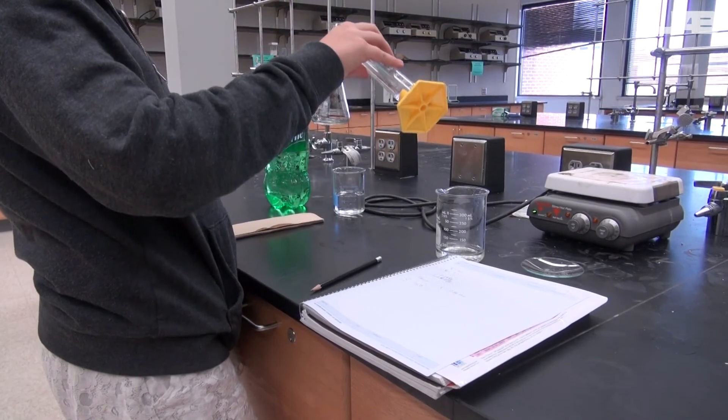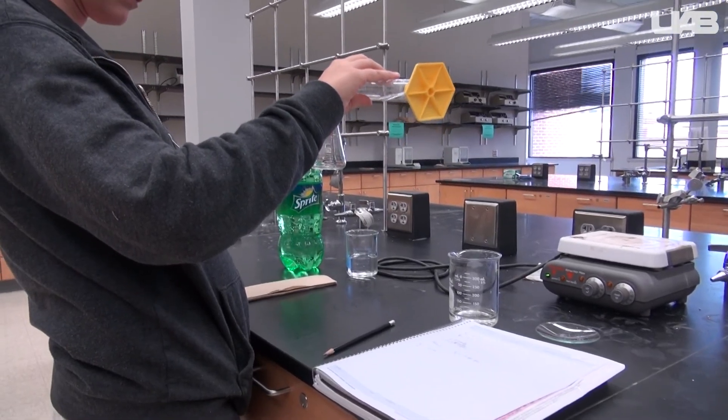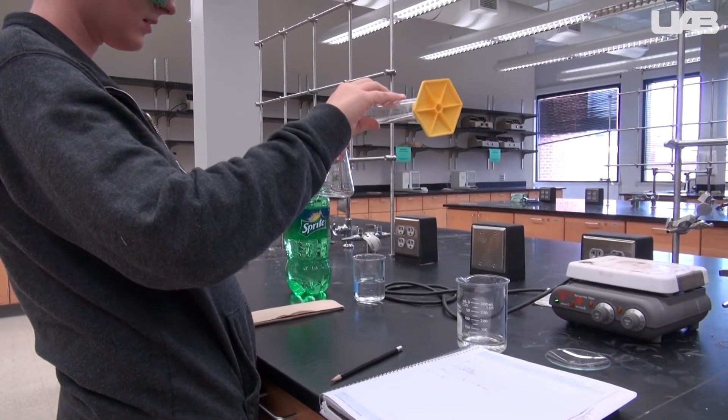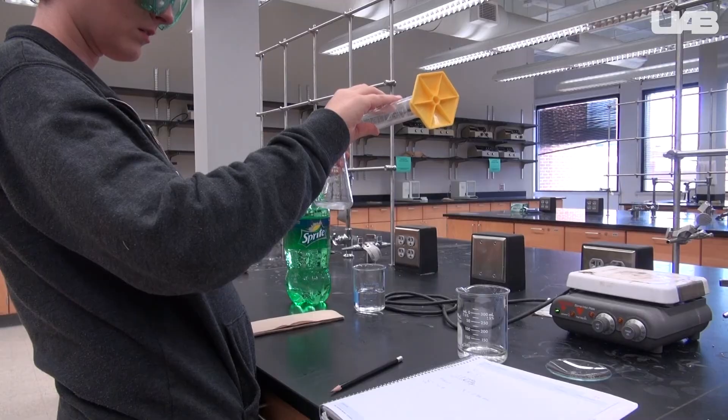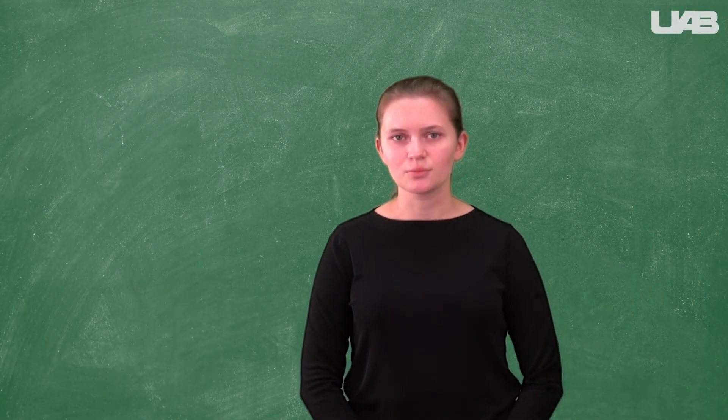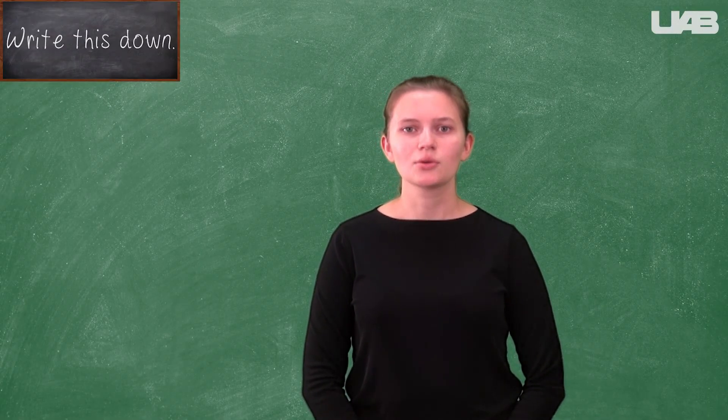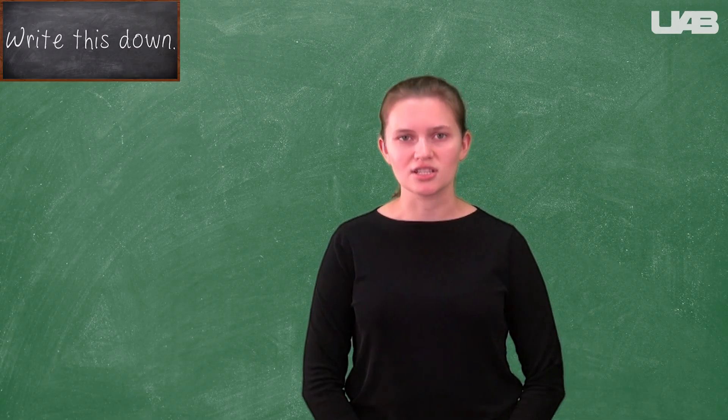Pour about 25 milliliters in an Erlenmeyer flask and add some distilled water to make the volume great enough that the endpoint is easy to see. Follow the same titration procedure shown earlier. You will perform a total of three titrations of the soda.